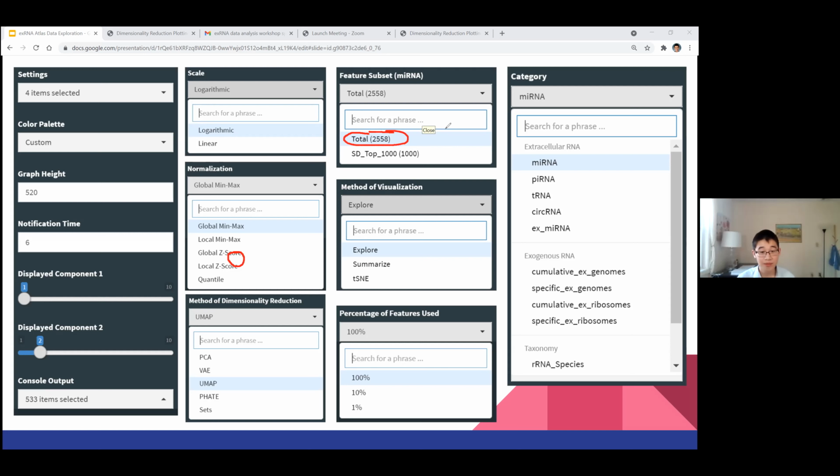And you could take a subset of microRNAs and run dimensionality reduction on that, but it would take some time. The issue is that subsetting the data beforehand would change the result of the reduction, which is the bottleneck. But yeah, the workflow allows you to subset the table, but it will not be instantaneous on the user's end. If the user wanted to eliminate a sample from the analysis, that wouldn't be immediately feasible for them without waiting a bit at least.